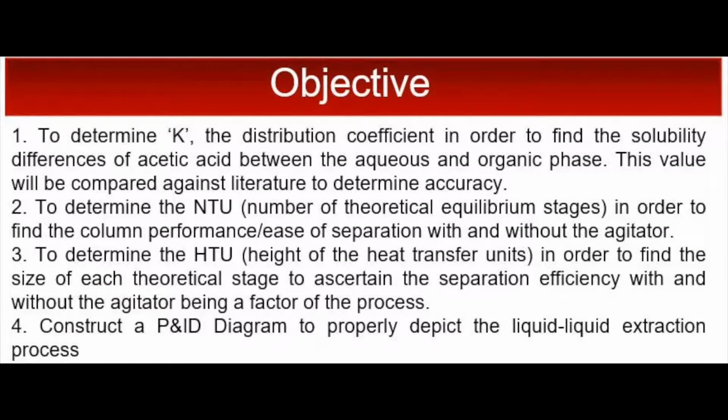The main objectives of the experiment we conducted were to determine K, the distribution coefficient, the number of theoretical equilibrium stages, the height of the transfer units, and to construct a P&ID diagram.